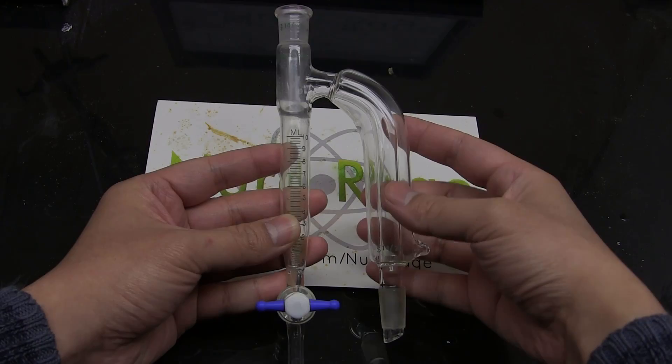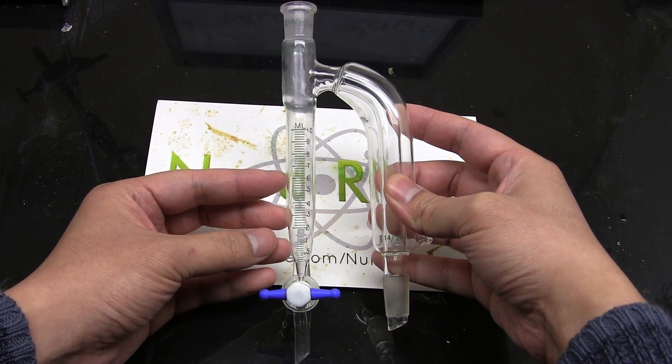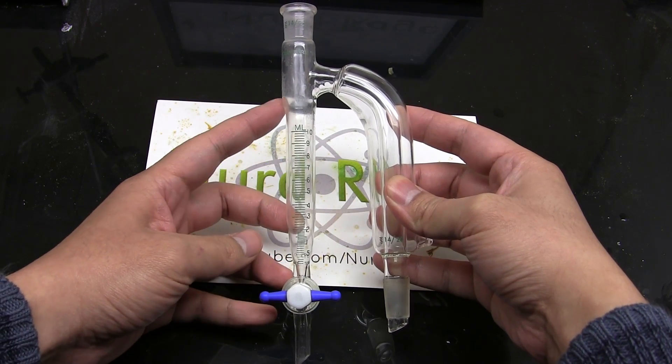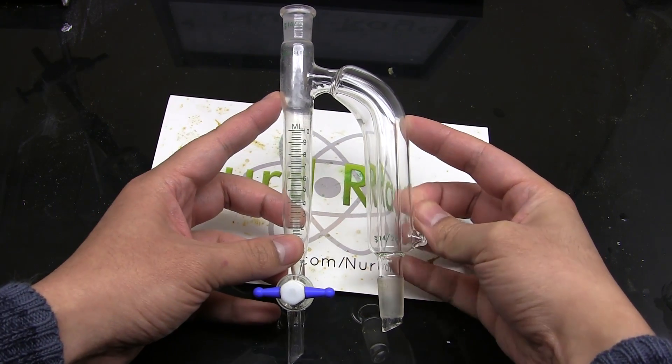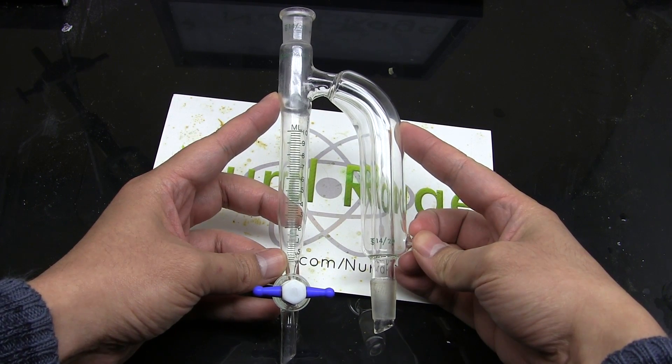So once again to the individual that donated this, thank you very much, I would never have bought one myself. Now if you use one very often in your work then it's worth getting a professional unit. But if you rarely need one then a very crude unit can be constructed from more common glassware.